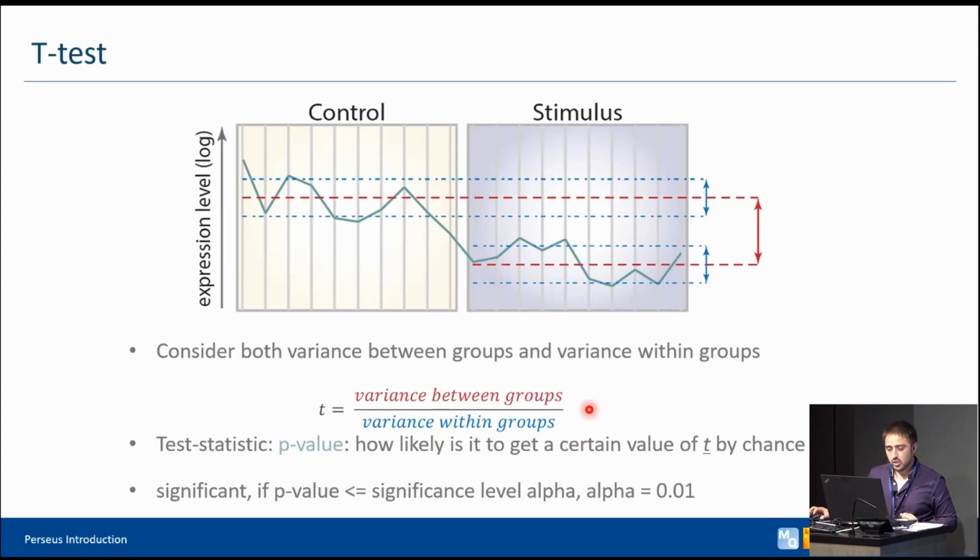Exactly. So you do this for many proteins, for 10,000 proteins or whatever your sample has, and then you still want to know, okay, which ones are. So I calculate this for all of them, and then you want to see, okay, how can I go one step further? What does it mean?